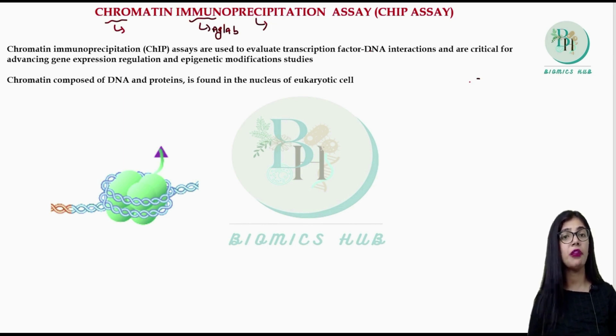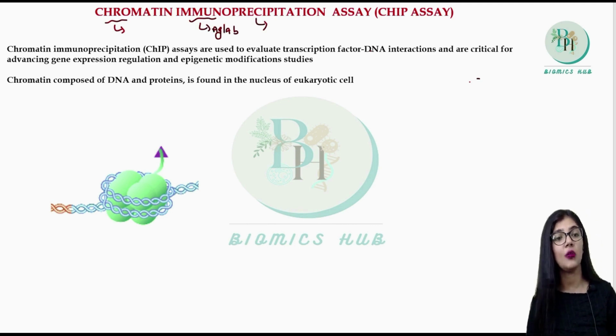the protein. In our previous video, we have already discussed some other techniques which are required for studying the interaction between the DNA and the protein, like the EMSA as well as DNA footprinting.